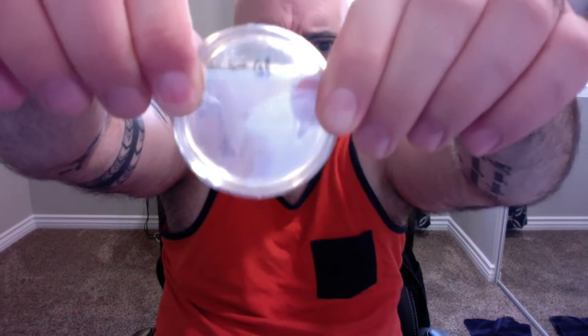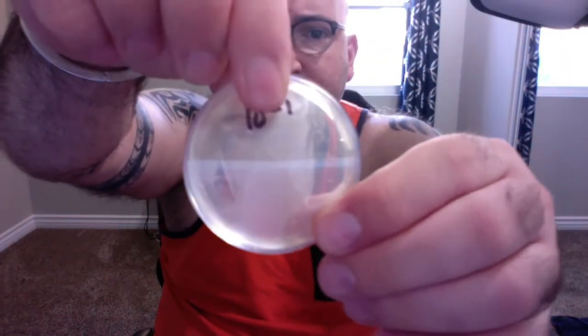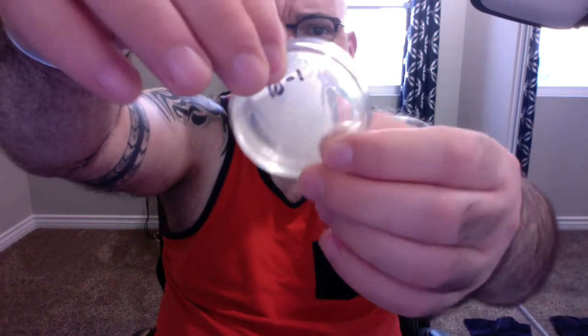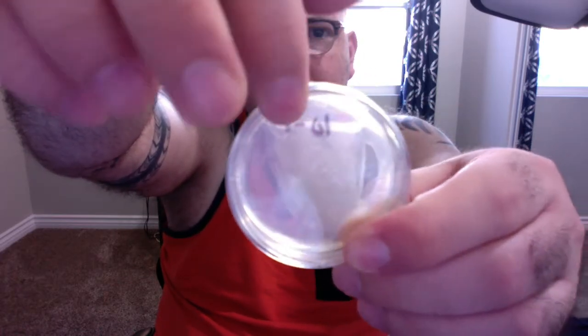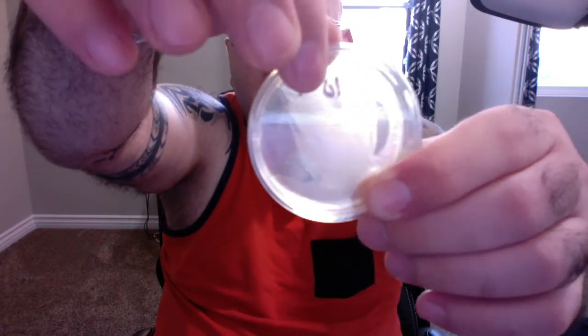I don't see 30 to 300 little pinpoints on this dish. Maybe on the back, I don't know. There's a few here, but I don't see anywhere near 30, so I don't think this would be a viable sample.